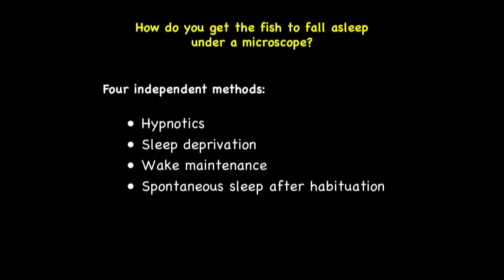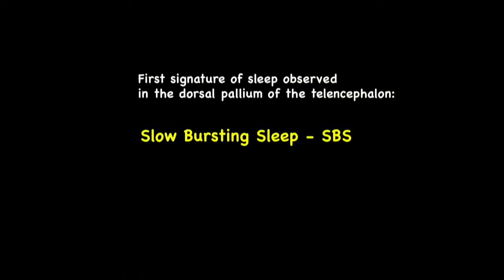So then you have the lines, you have the microscope. How do you demonstrate it's sleep? How do you get an animal to fall asleep under a microscope? Whether you use mice or fish, it's really not easy. So we used four methods: hypnotic, sleep deprivation, wake maintenance, meaning we prevent them from taking naps during their daytime, and, of course, spontaneous sleep after they get habituated to this microscopy environment.